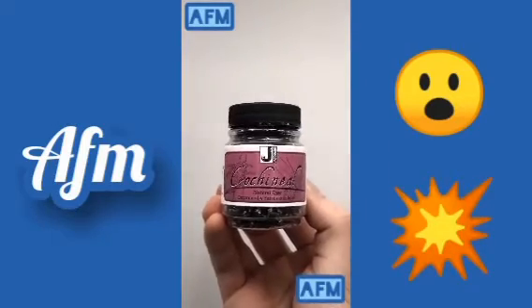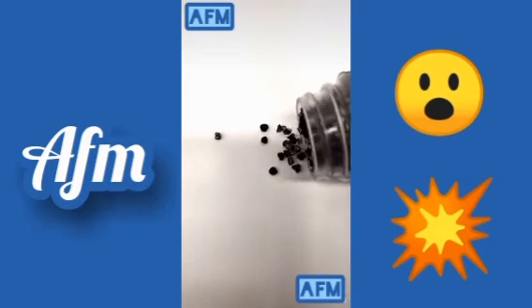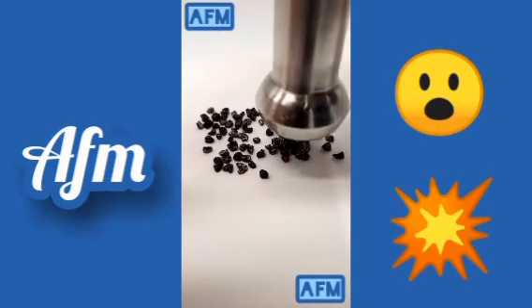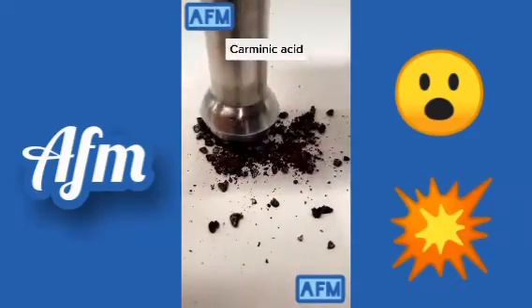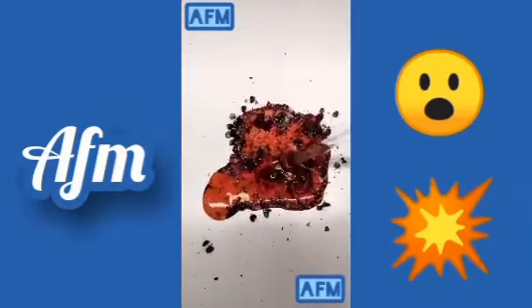This is cochineal, which is a parasitic insect that generally lacks self-locomotion. What's interesting about them, though, is what happens when I crush them. They leave behind a lot of nice red powder because they have something in them called carminic acid. This is commonly used to make dyes for foods and in things like lipstick.